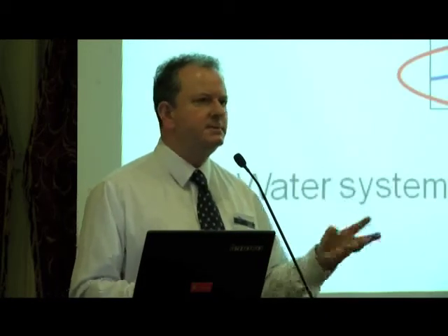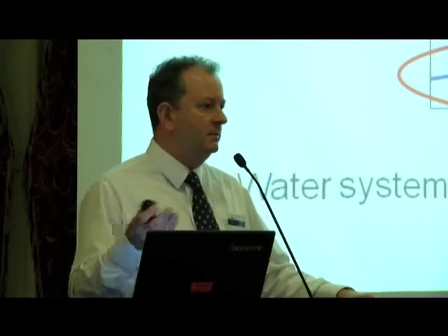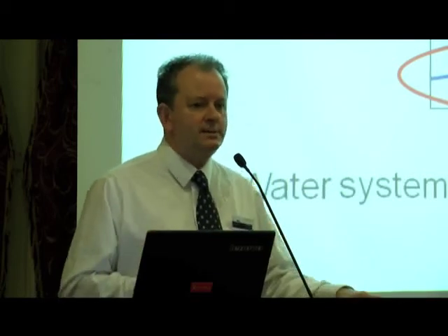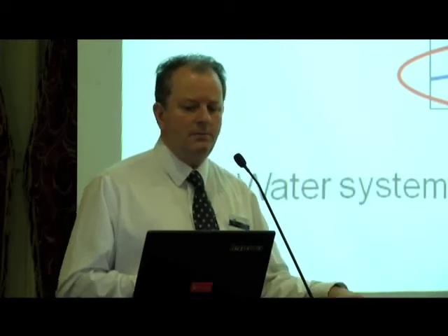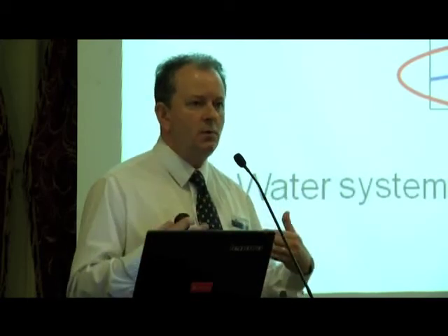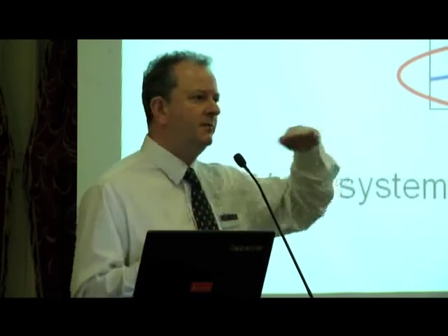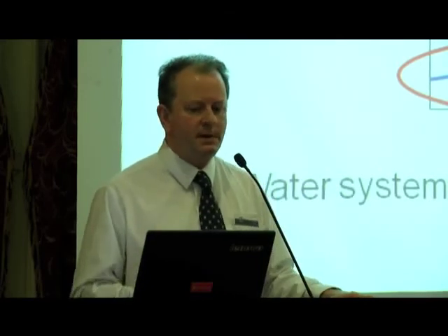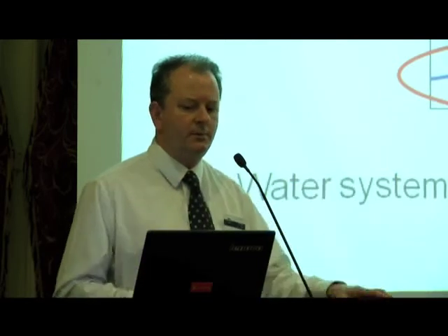So your water system, a modern water system, typically 30 parts per billion of TOC, very low. Sometimes I've seen 7 or less than 10 ppb. So your water system is operating very low, but what the pharmacopoeias tell us to look for is no more than 500 ppb, which we heard from the last speaker. He said the limit, 500 ppb for TOC. So what we do with calibration on site is we have 3 calibration standards, and we bracket the 500 ppb.